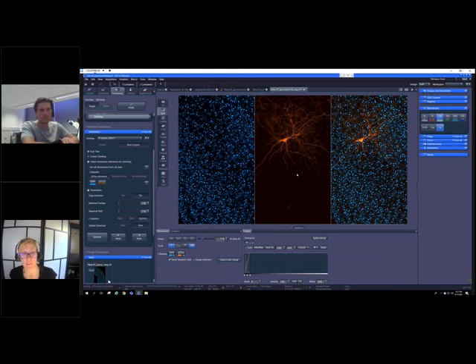Yeah, so the answer is yes, you can do that. Because as you see, the AI sample finder is designed in a way that you can easily put an incubator around it. So all the additional hardware components like the camera and the LED illumination sources do not interfere with any of your incubation solution. May it be a large incubator, the XXL incubator setup, or even the small incubator, the incubator S for the stage, so the stage insert incubator. All of that works with the AI sample finder illumination and detection.